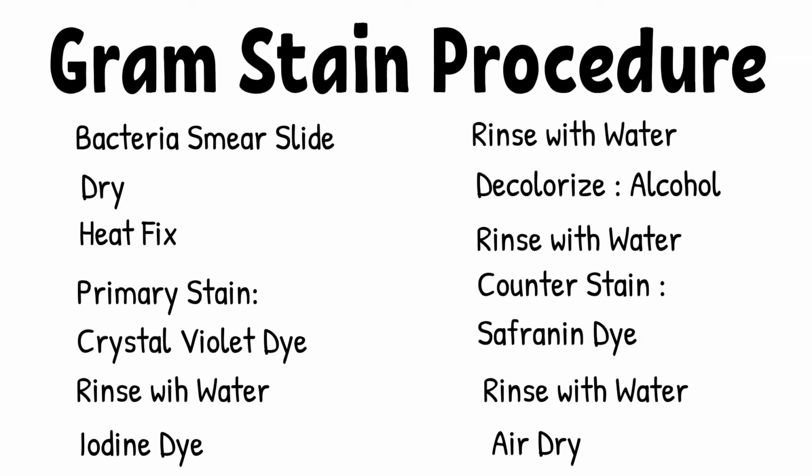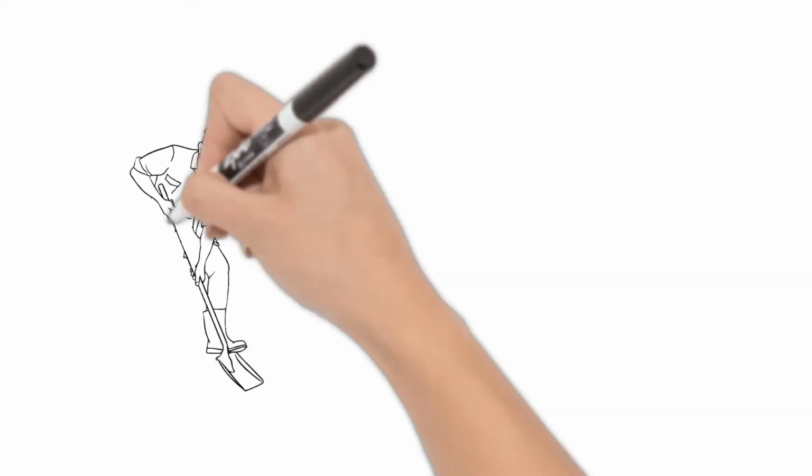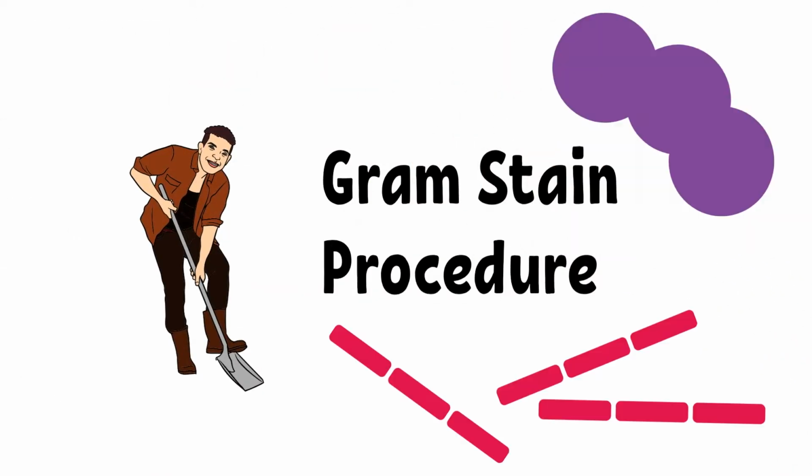And that's all for gram stain. That is easy, right? Now let's take a look at why we are doing each step the way we are doing it. Let's go. Okay, now we are going deep.